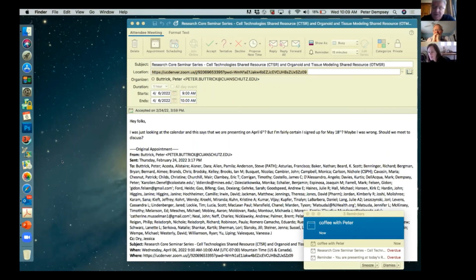That's something we can do for sure. And in terms of CAR T cell, we can make the organoids express certain antigens, or they may already have them. So we may actually have validated models to test CAR T cell reactivity as well.